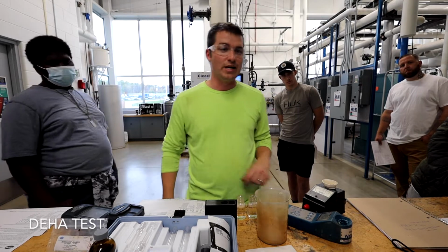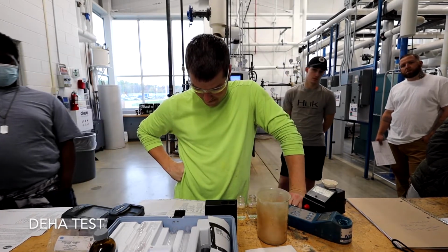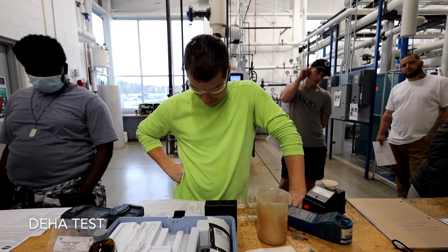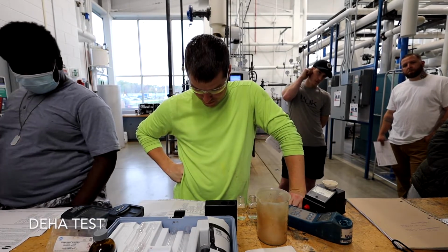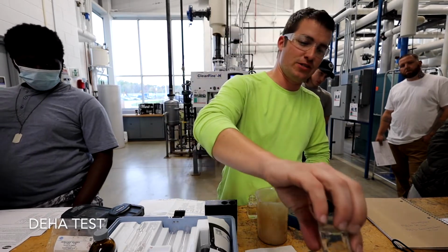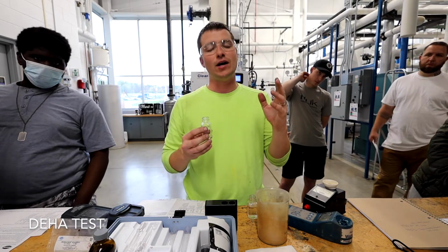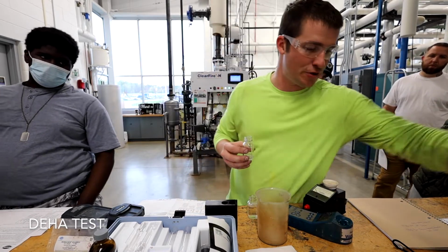Okay, I'm going to stop you right here. I have a question. For that sample bottle B, thoroughly rinse a second mixing bottle with demineralized water that contains no oxygen scavengers or ferrous, and fill it. Oh, you're right. Thank you for catching that. Because for the blank, if I use this, we'll have no contrast. Correct, it'll turn purple too. So thank you for catching that.